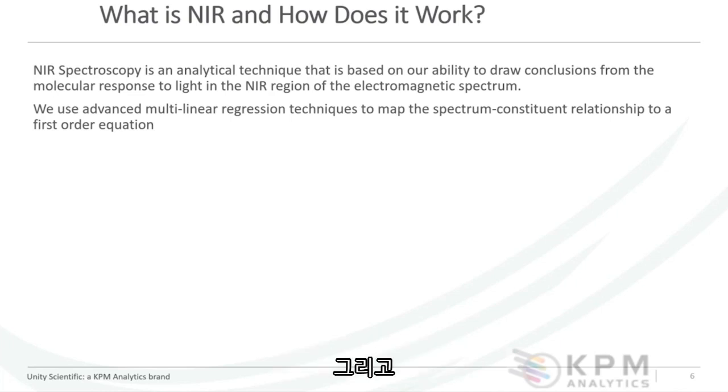That phenomenon in and of itself does nothing, but we can combine it with some pretty sophisticated math, and we can pull information out of this spectra and out of this interaction, and create a relationship between this interaction with our sample and our constituents of interest.